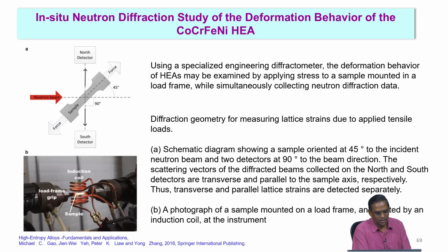You have neutron diffraction facilities in India, in the DAE labs, but internationally, a lot of labs are accessible to everybody, and all academic people can go and do these experiments. For a complex high entropy alloy deformation study, neutron diffraction will shed light in much more detail as compared to conventional deformation or in situ study in normal electron microscopy or X-ray diffraction.